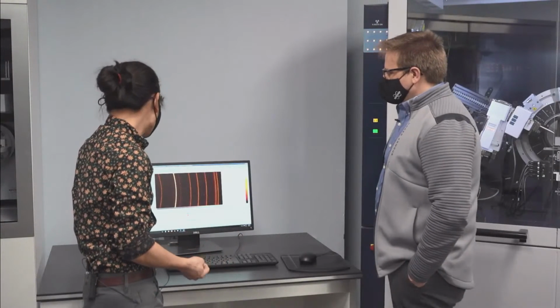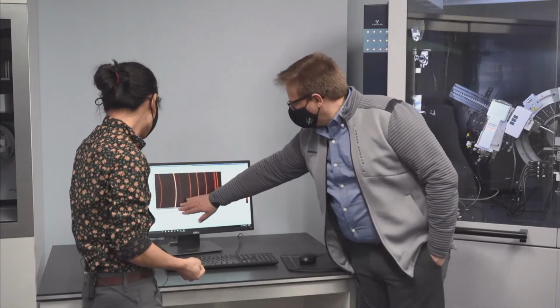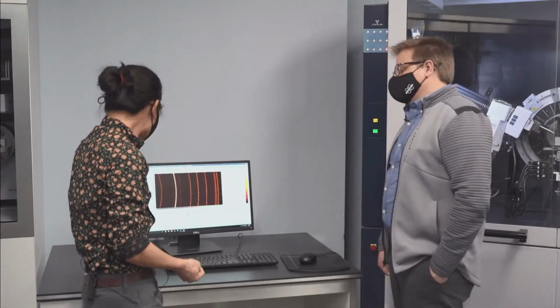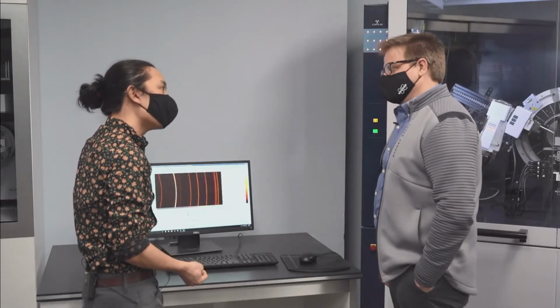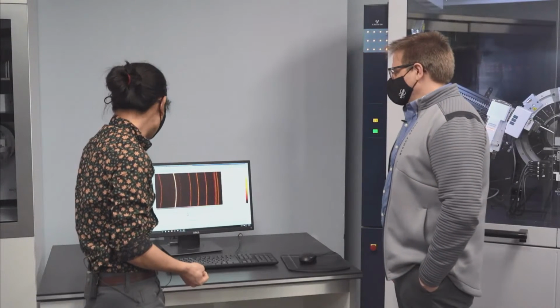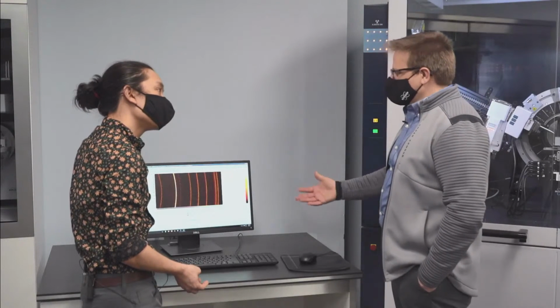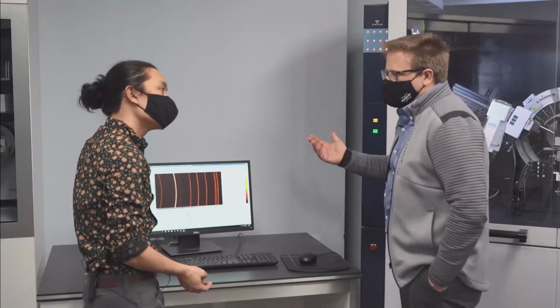Okay. Yep. So on that second peak, the really bright one, I'm not seeing either of those effects. So it looks like this is probably a pretty well prepared powder. Okay. So now, if I wanted to do something a little more complex, I mean, here we did some simple scans, but what if I wanted to do a pole figure for texture analysis?